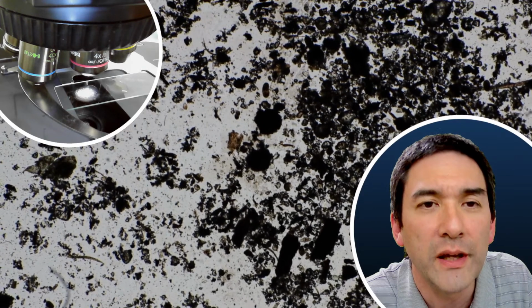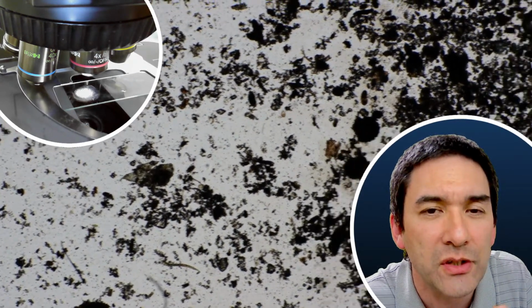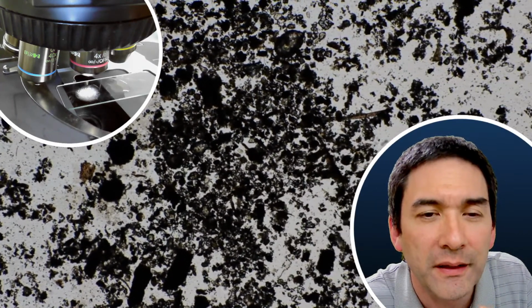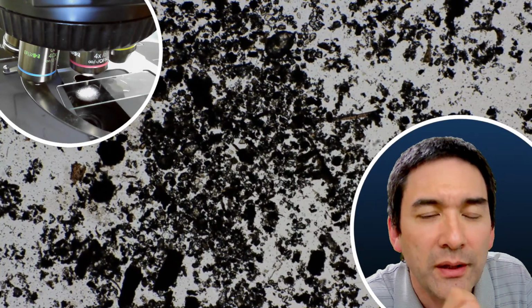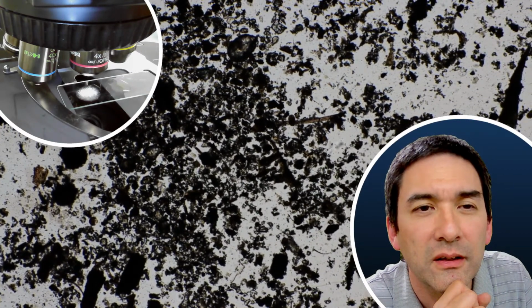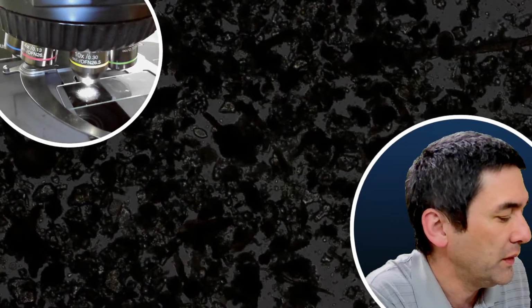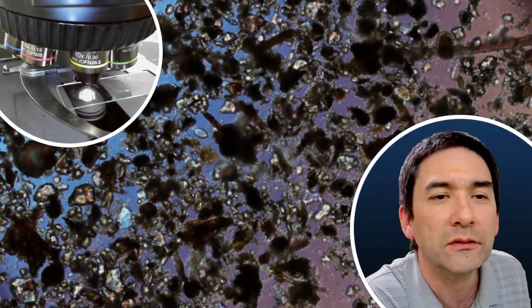Sometimes the tardigrades like to hide behind sediments. So sometimes if there's a little piece of sand or something like that, it clings to the sand, and then it's kind of difficult to see. Okay, but there is quite a bit of movement going on here. So let's go up again with the magnification.